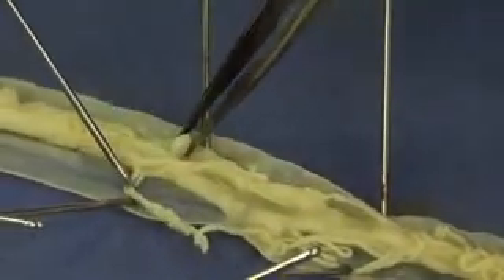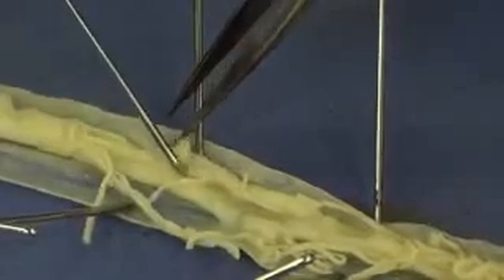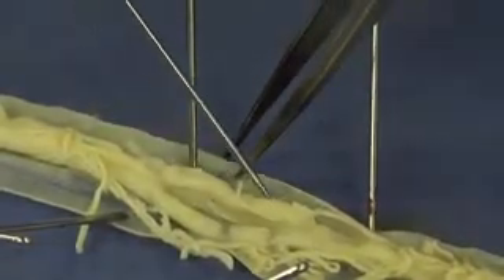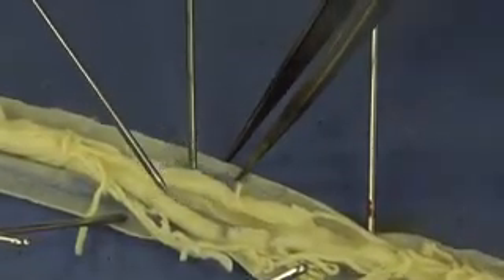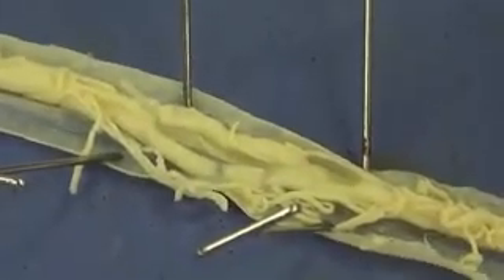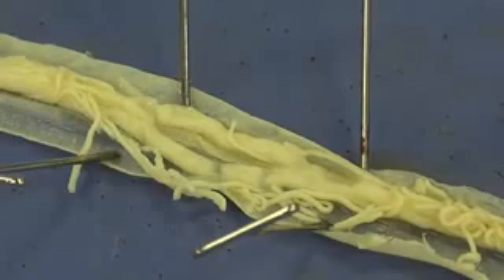If I continue my way down, just moving these oviducts out of the way, you can see more clearly the two uteri. There's one right here and there's the other one right there. That is where fertilization of the egg actually takes place. From there, the fertilized egg is going to exit through a tiny little hole called the genital pore and be deposited outside the female's body.